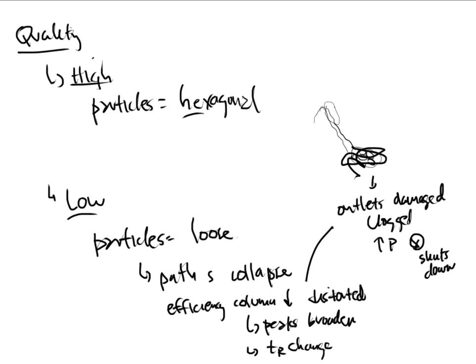Guys, in the last video, I told you that in this one, we're going to talk about a new term, and it's not really a new term, actually. This is something that we've seen before, and it's going to be called void volume. So we need to go through and revisit what this actually means. And void basically means empty, right?